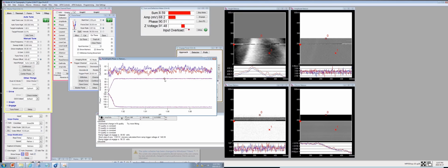Experience still tells me that you should never go below 90 here in this step. If you go below 90, you won't get the actual data. If you have 91, it's fine because the software will actually correct and tell the system that this should be 90 exact. But anyway, it should be good to be approximately at 90-91 degrees here.